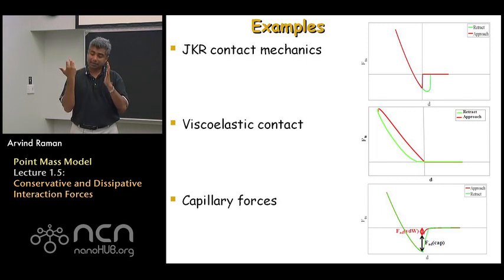What happens in that case is that as the tip comes close to the sample, the sample itself can deform and form a neck, due to the low elasticity and high adhesive forces, which require the tip to move and break this bond effectively. And this is different from the cantilever snap-in and pull-off.